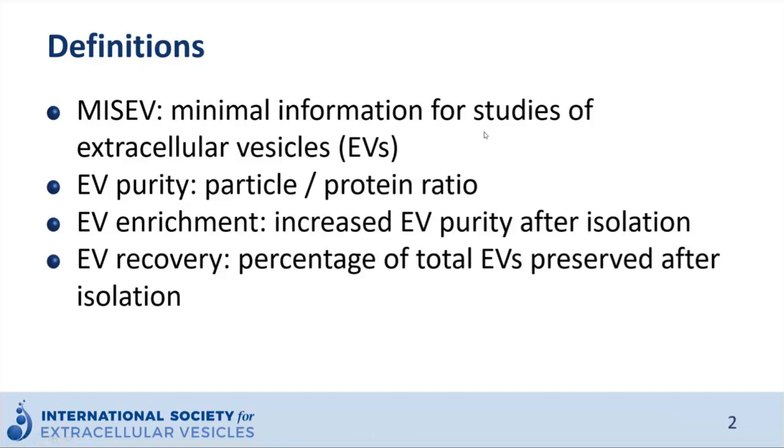When we talk about EV purity, I would emphasize a parameter called particle-protein ratio, which measures how many particles per microgram protein in a certain EV isolation. We know that high abundant protein contamination is a major concern for EV isolations from many sample types, including serum, plasma, urine, and other protein-rich biofluids.